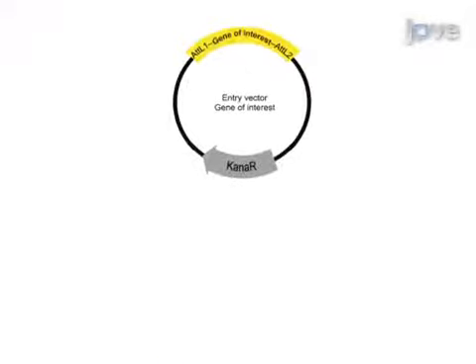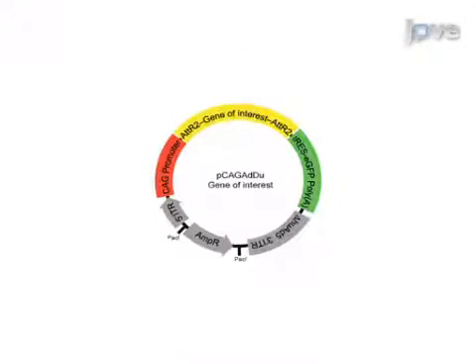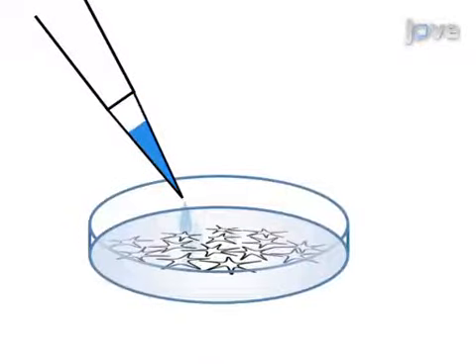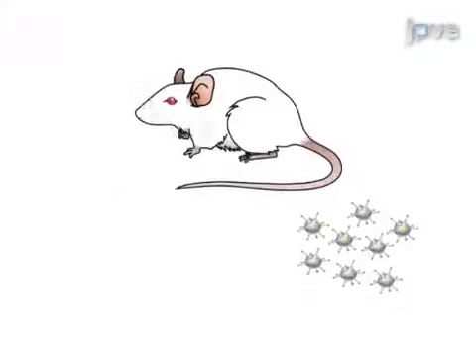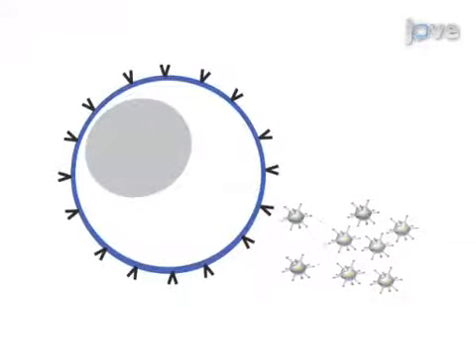First, the gene of interest is cloned into the adenoviral destination vector. The vector is then transferred into the adenovirus producer cell line HEK293A, and infectious adenoviral particles are generated. The resulting viruses are used to infect naive T cells from mice with an adenovirus receptor transgene.